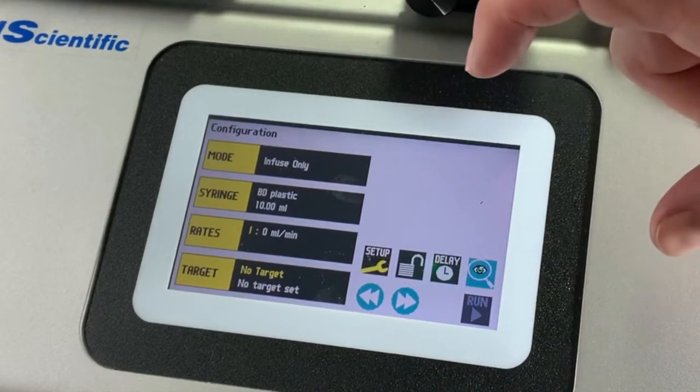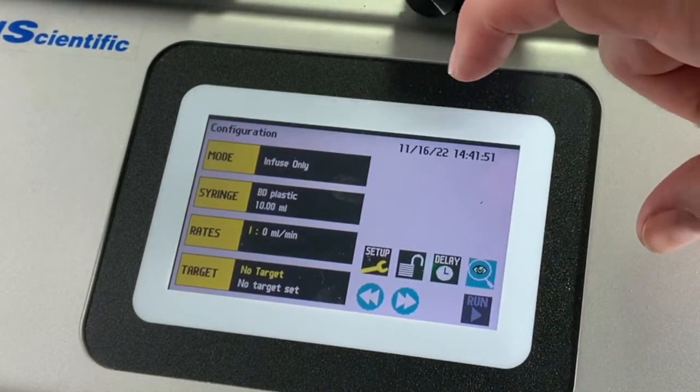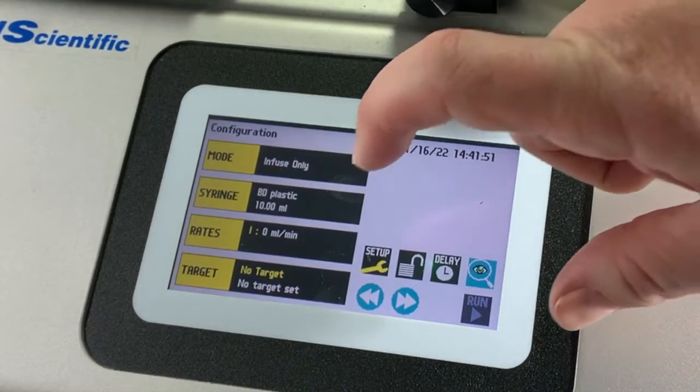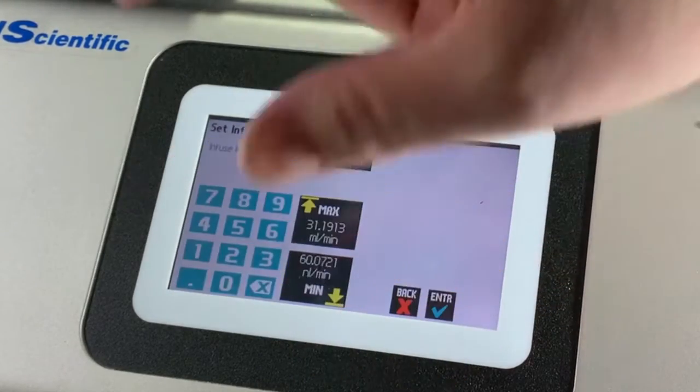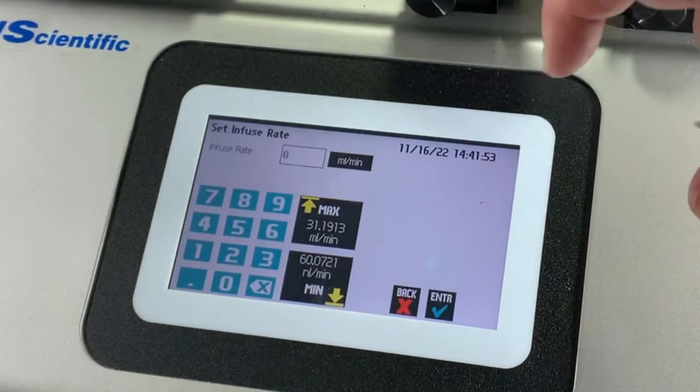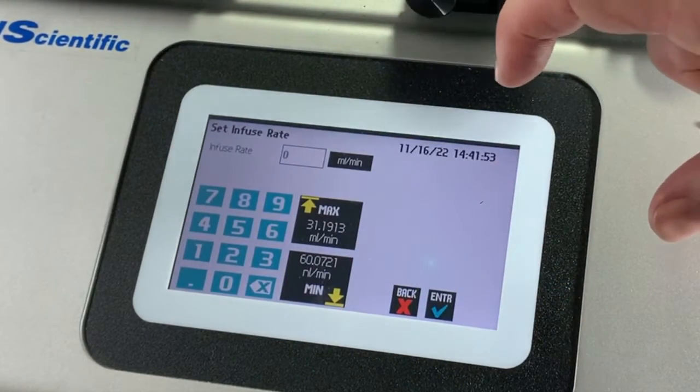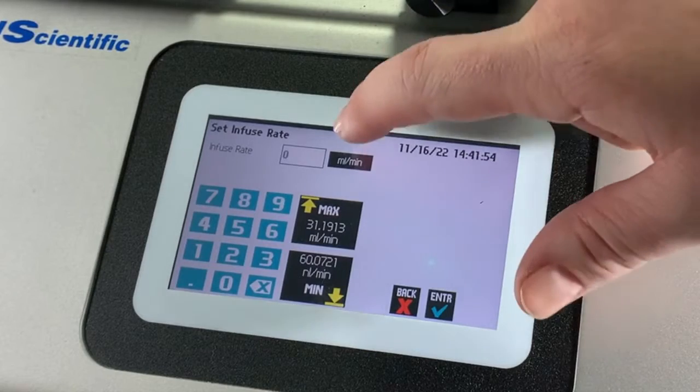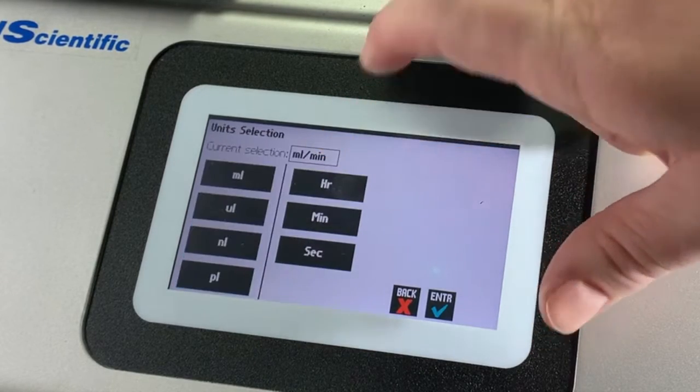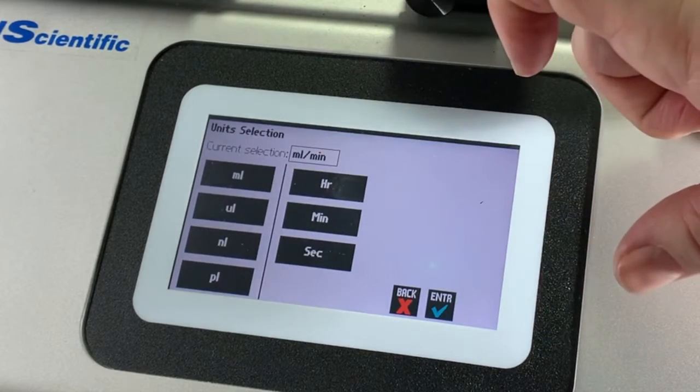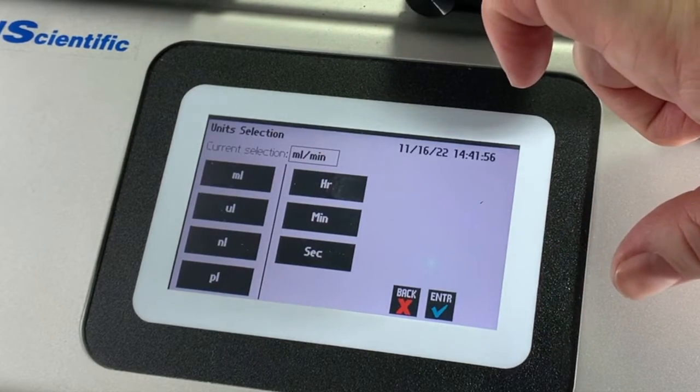The pump will use that volume syringe to then help you calculate the flow rate. All you need to do is select the rate that you want, for example in mLs per minute, and you can toggle between the units very simply.